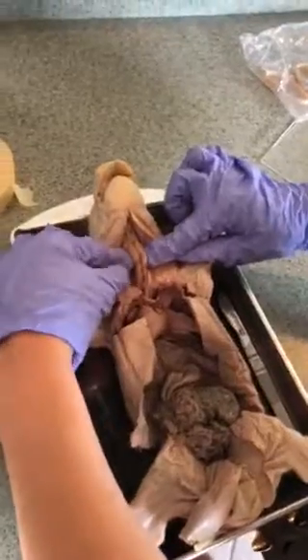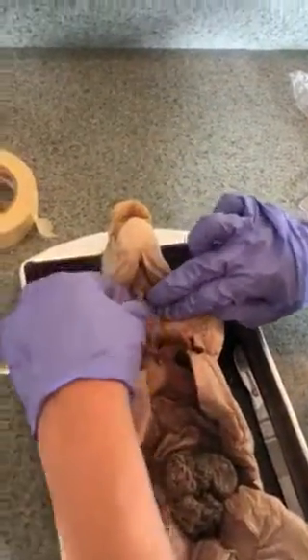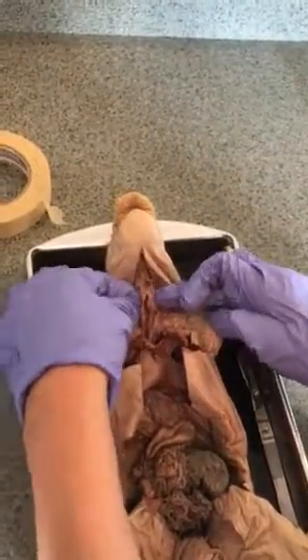Then we have the larynx, which is this box up here, and I actually accidentally cut mine, but you can see the vocal folds a little bit in there.